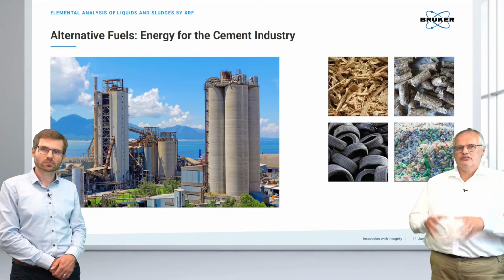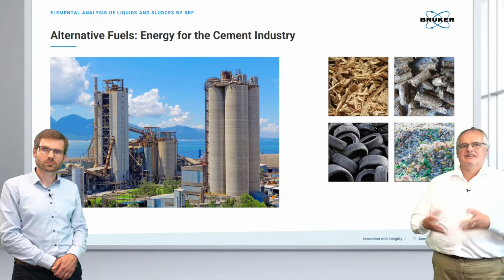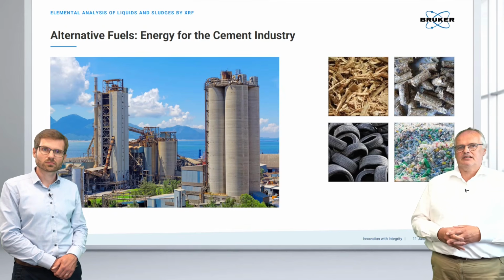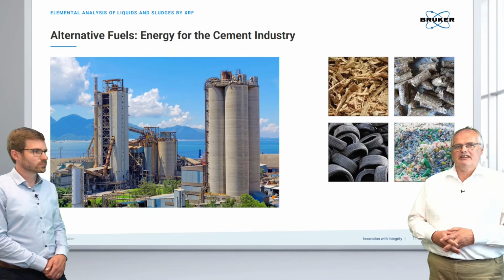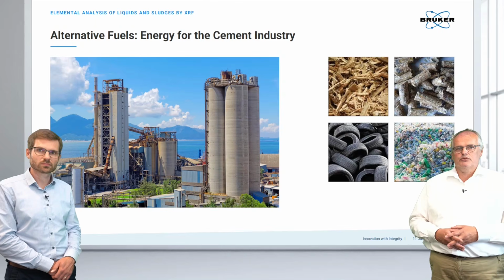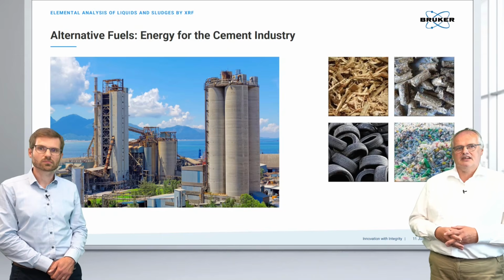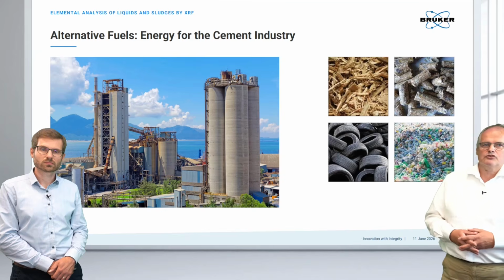Now we are going into a field which is a little bit different, because this can sometimes be really a surprise package. It is the processing of waste. Here, for example, the cement industry is using any kind of waste to replace primary fuels. It can be wood chips, tires, or plastic waste. And this is burned, and of course we need to monitor the elements.